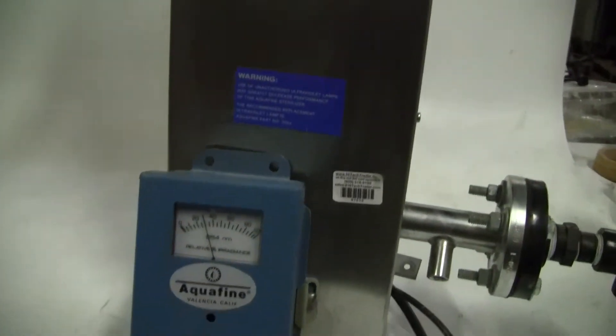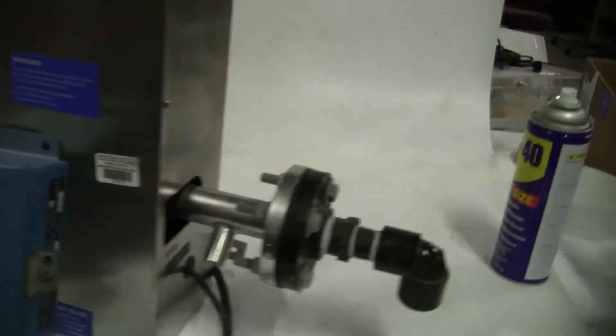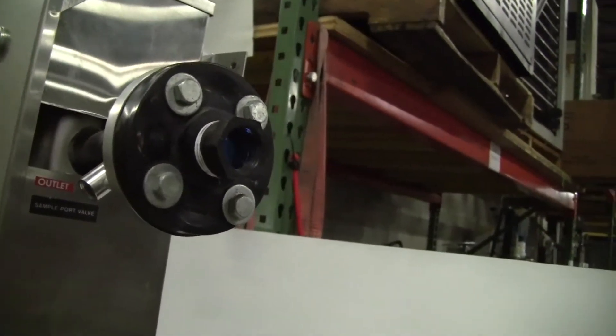We have a gauge to tell us how much light is being put out. There's your intake port. It goes up to your outtake. You can see the light flashing inside there.